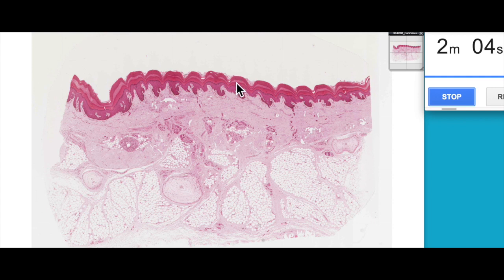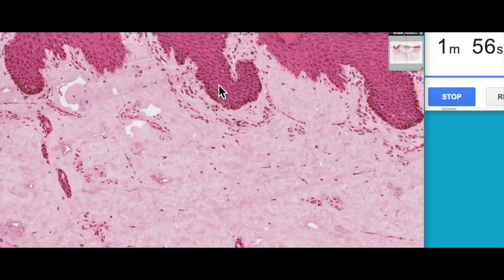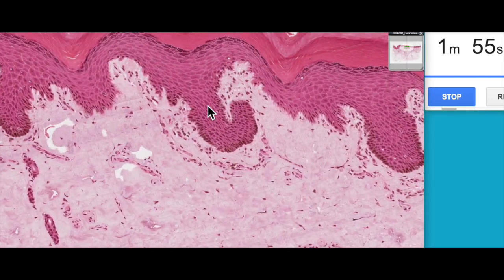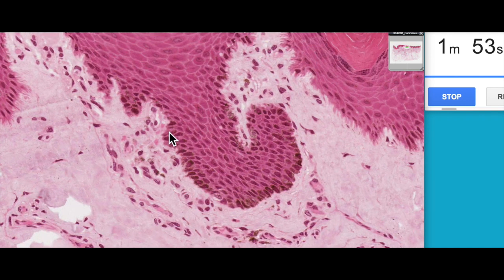The easiest way to identify thick skin is to look at the thickness of the stratum corneum, or the dead layer on the outside — very, very thick here. The innermost layer of the epidermis is this layer here, known as the stratum basale, or the basal layer.